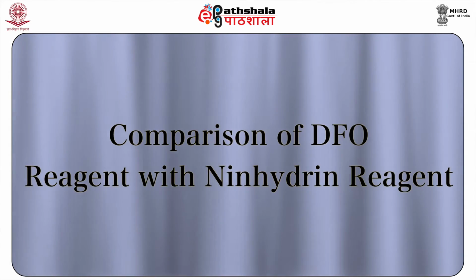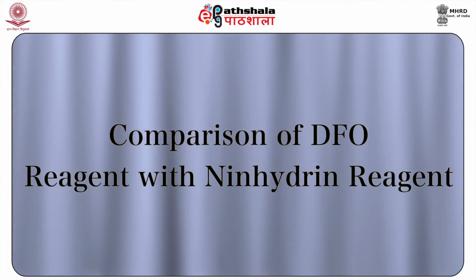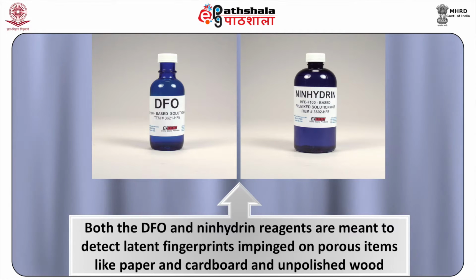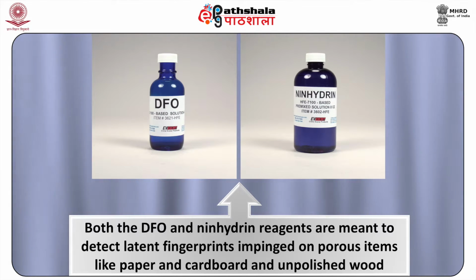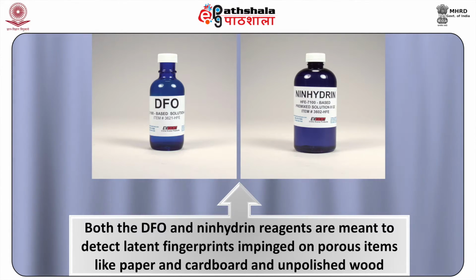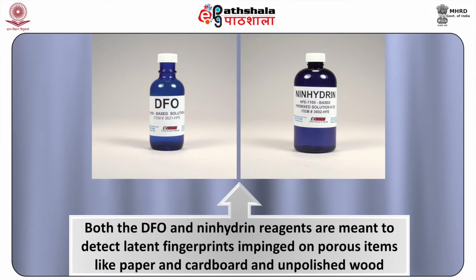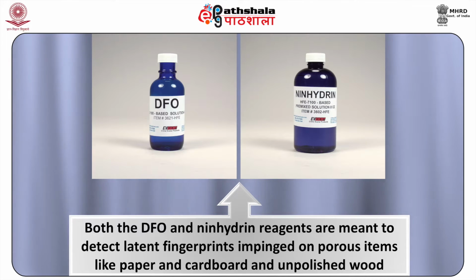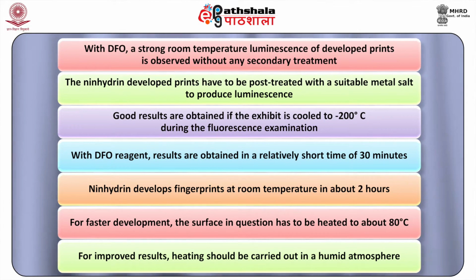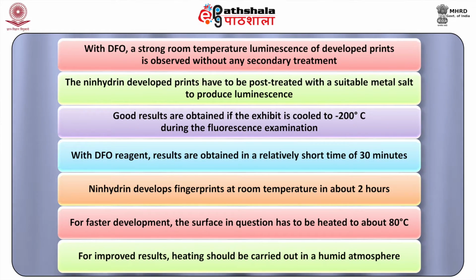Now let us see a comparison of DFO reagent with Ninhydrin reagent. Both the DFO and Ninhydrin reagents are meant to detect latent fingerprints impinged on porous items like paper, cardboard and unpolished wood. It is therefore pertinent to weigh out the utility of one reagent vis-a-vis the other. The DFO technique offers the following advantages over the Ninhydrin methodology. Number 1. With DFO, a strong room temperature luminescence of developed prints is observed without any secondary treatment.